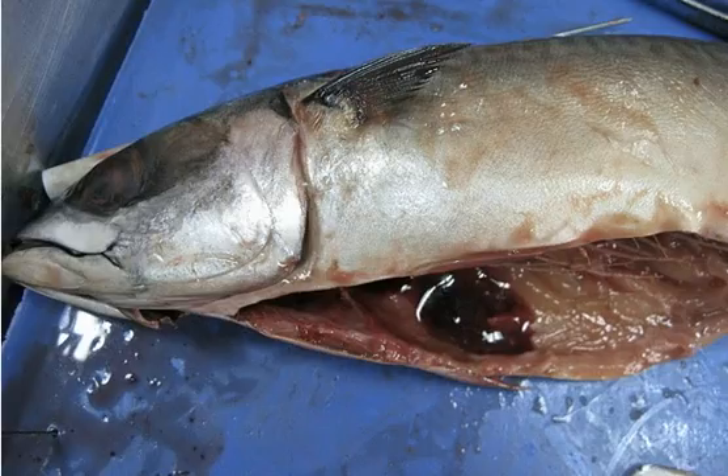This dissection was really bloody because of the lung part and other areas. If we look at the fish that we dissected, this is the fish.